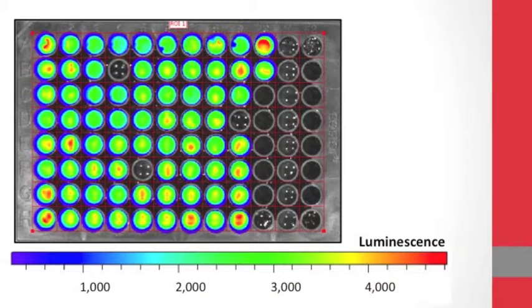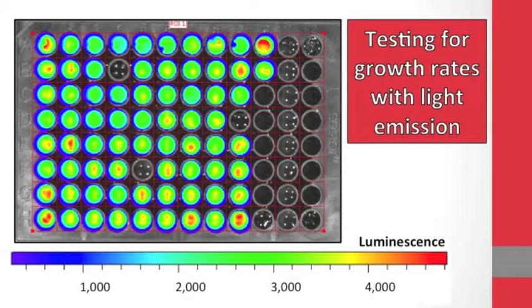Not all genetically transformed strains function the same as naturally occurring wild strains. We first tested transformed strains for growth rates using light emission. Those that emit a brighter light are most comparable to the wild type in terms of growth rate. Since the locations of the lux genes are unknown, pathogenicity also has to be tested to be sure virulence was not affected.